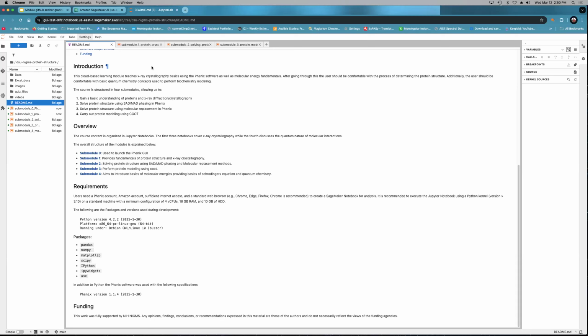And it can be very frustrating because you wind up spending more time trying to get the software to work than actually playing with your data and looking at structures and building things. So what's nice about this notebook is that it'll have all of the software you need already integrated into it. So that gets over some of the more difficult hurdles that are associated with it.